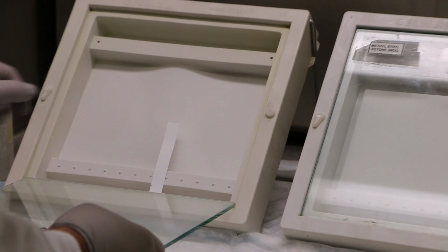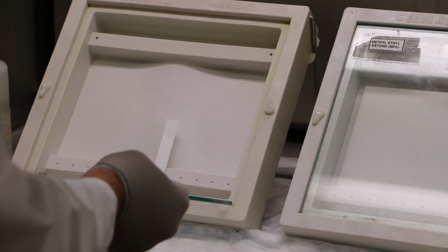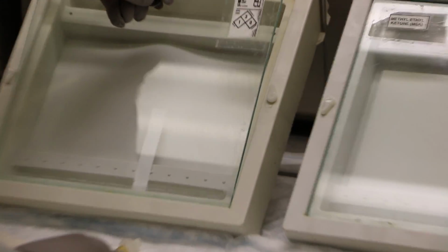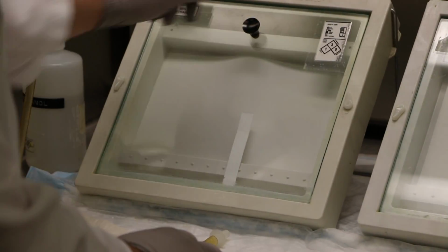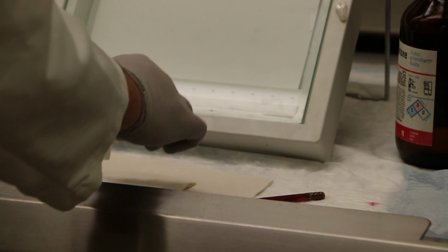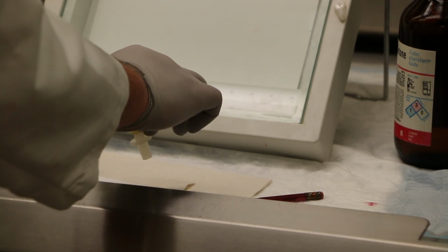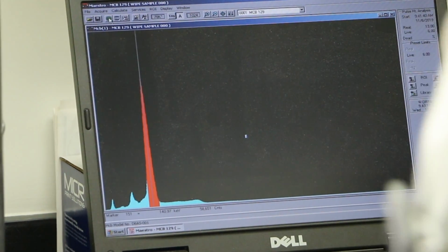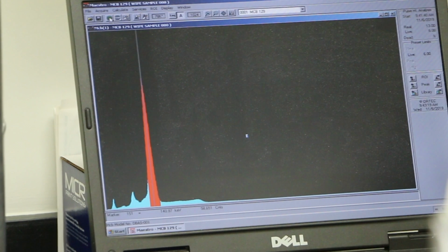Chromatography for the sulfur colloid solution is tested using an 85% methanol solution. The strip is placed in the solvent tray and time allowed for the methanol to climb the test strip. After about 7 minutes, remove the test strip from the test tray and dry with compressed air. Once again, place the origin over the well counter aperture. Clear the reading on the computer and observe the value.